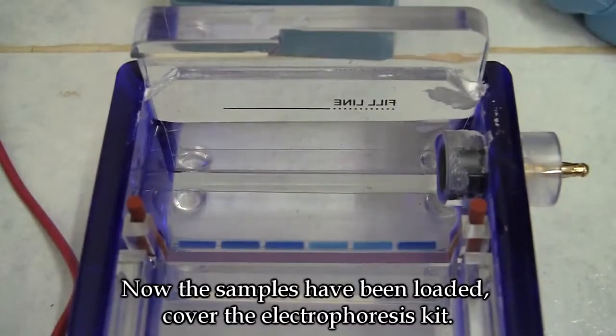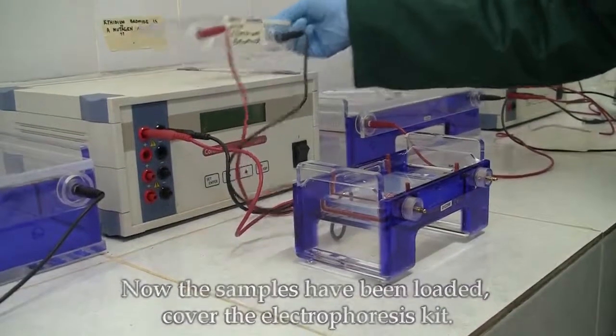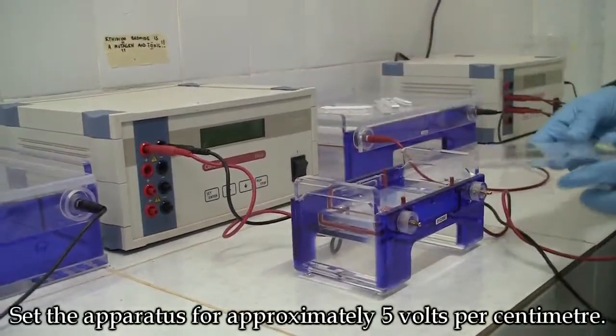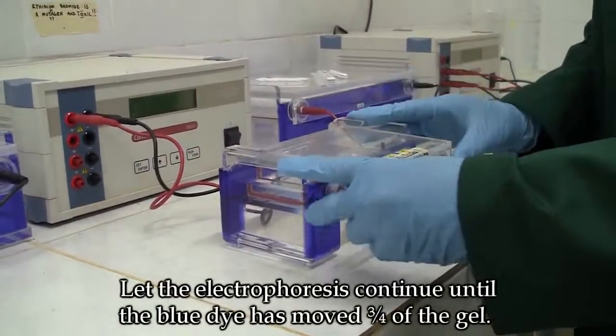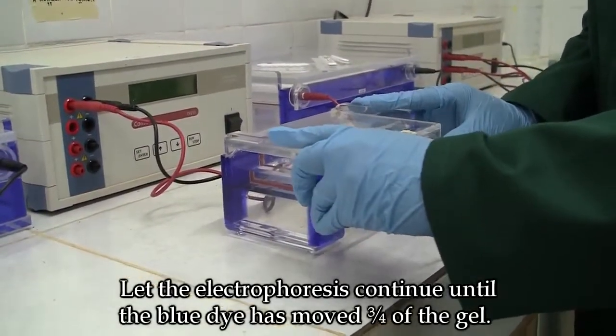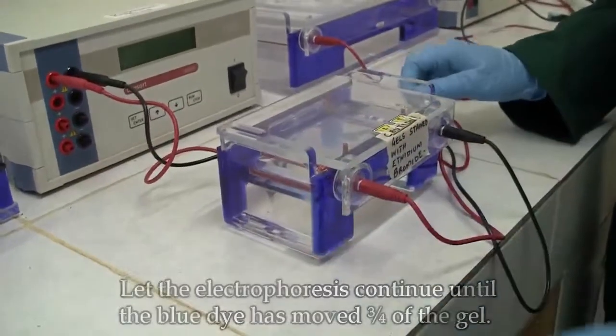Now the samples have been loaded. Cover the electrophoresis kit. Set the apparatus for approximately 5 volts per centimeter. Let the electrophoresis continue until the blue dye has moved three quarters of the gel.